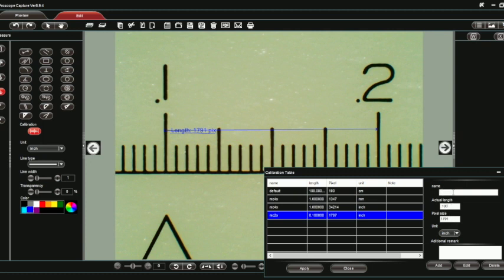I'm going to give this calibration a name. I'll call it MC for the microscope camera, 2X for the objective I'm using, combined with the 15X eyepiece that the microscope camera comes with. I'm also going to tell the computer that I'm calibrating at the 5 megapixel setting. When done, I'll click Add, and you'll notice that setting now shows up in the table.